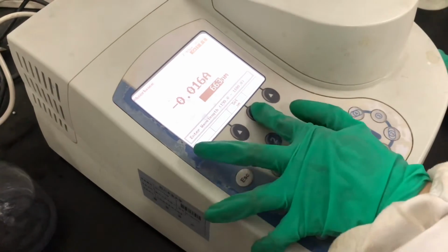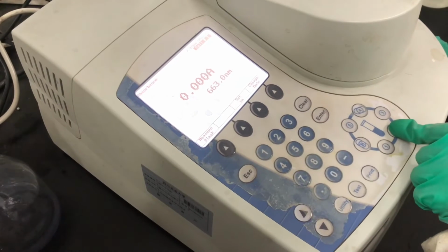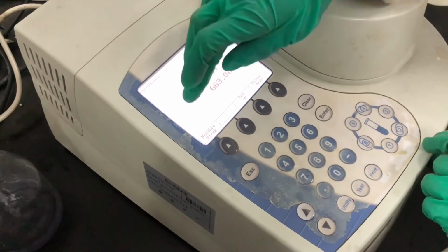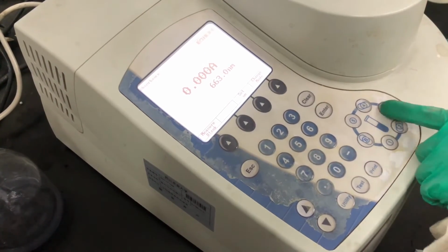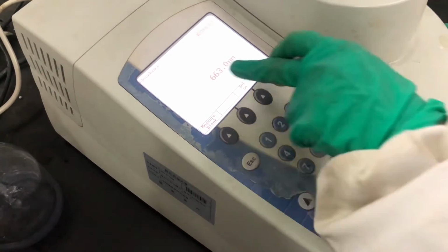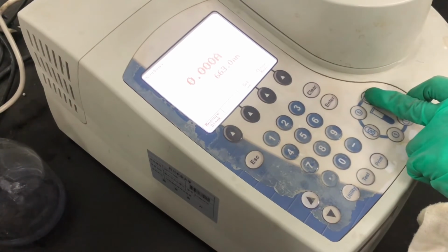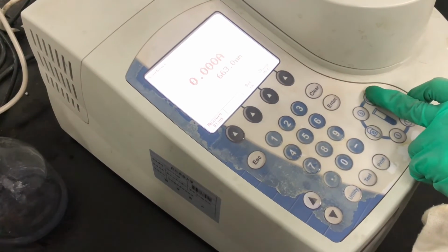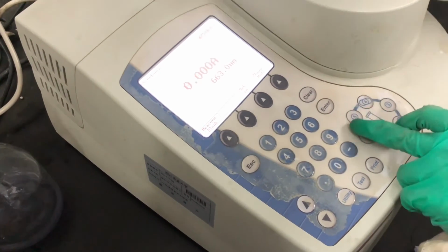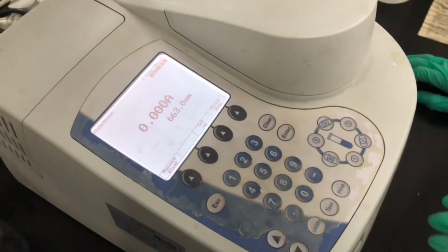663. It's okay. 1, 2. There is 2. Okay. You can measure. You can remember the data. Okay. And 3. Okay. And 4. And there is 4. Okay. And 5. And there is 5. Okay. You know.